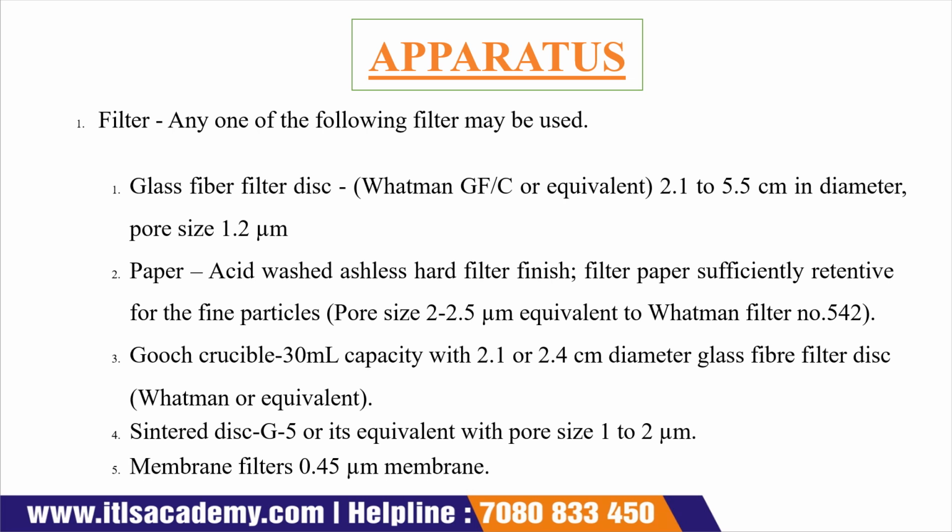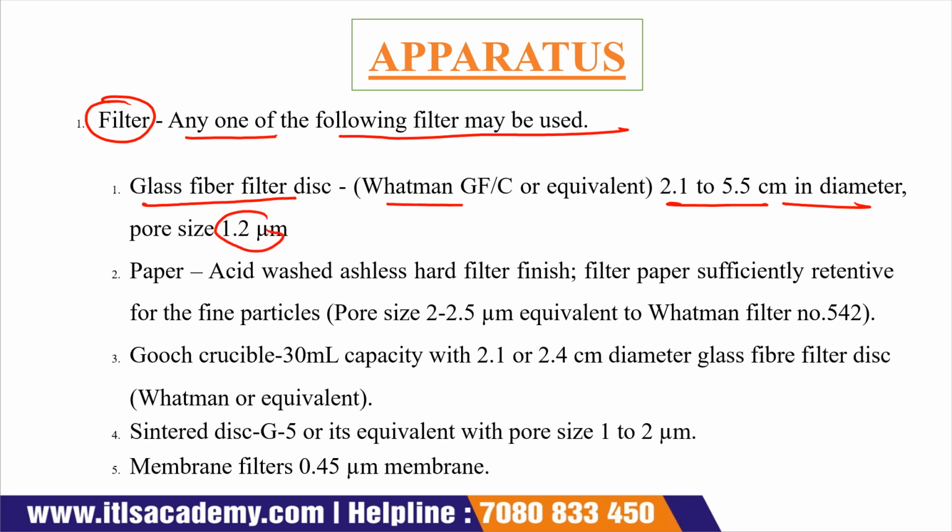Now the next one, apparatus required for this experiment. We require a filter, and any one of the following filters can be used. The first one is the glass fiber filter disc, that is Whatman GF/C or equivalent, 2.1 to 5.5 centimeter in diameter. Pore size is 1.2 micrometer.